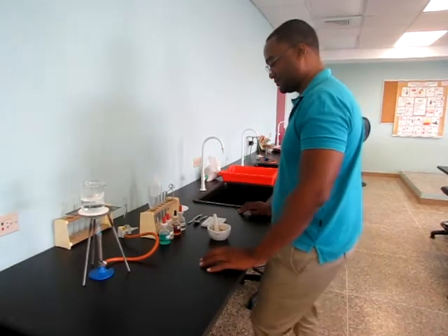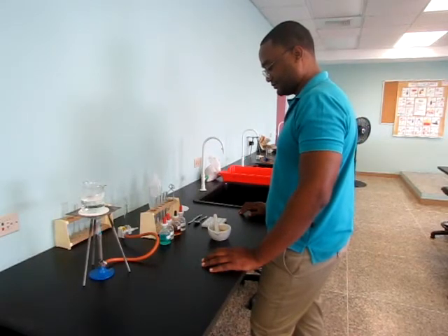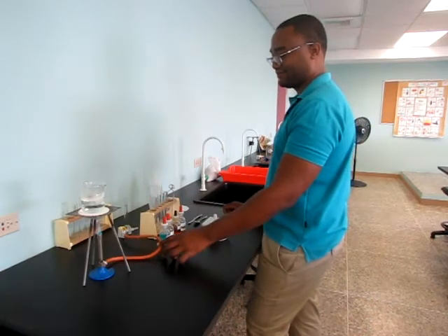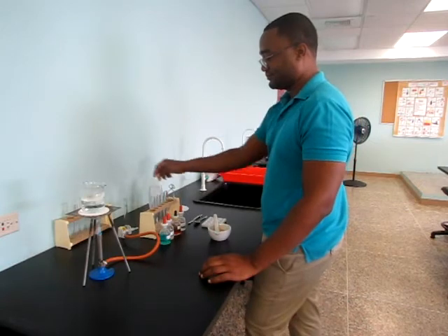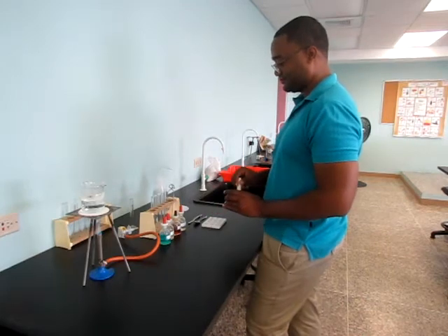For any of our agricultural SBA skills, we are required to show pre-operative procedures, which entails gathering all our tools and materials needed for this test. In this case we have our beaker, our tripod stand, our bunsen burner, our test tubes, our measuring cylinder, our distilled water, the chemicals needed, our mortar and pestle, and our tiles.